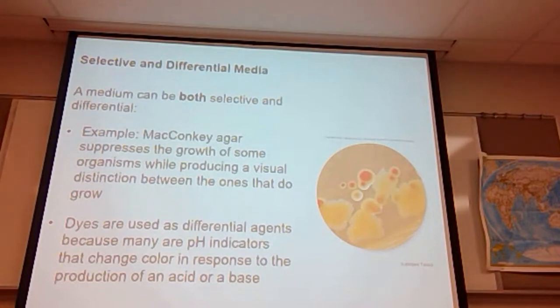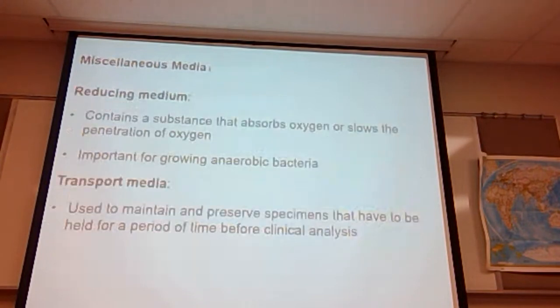So here's something growing on McConkey's agar. You've got this structure growing here, and these growing, and then you see the different colors forming on the different organisms.